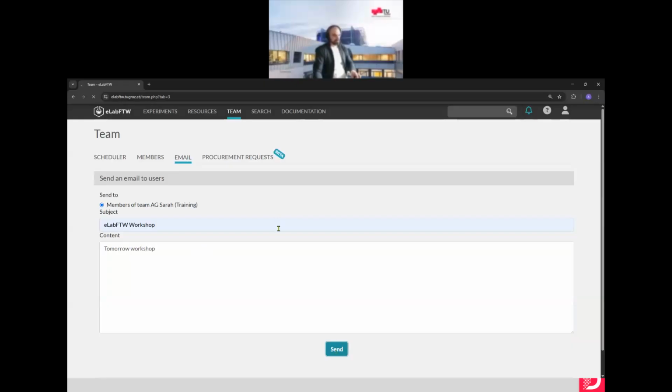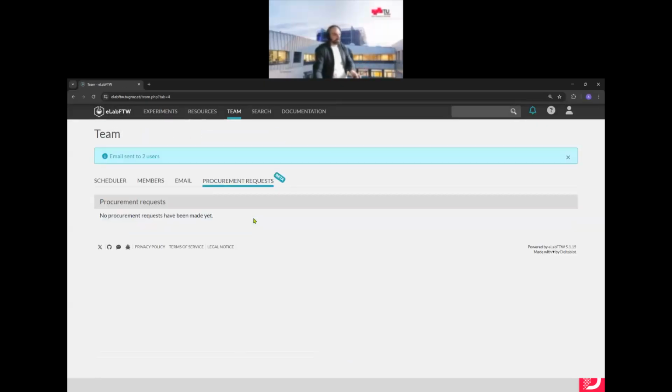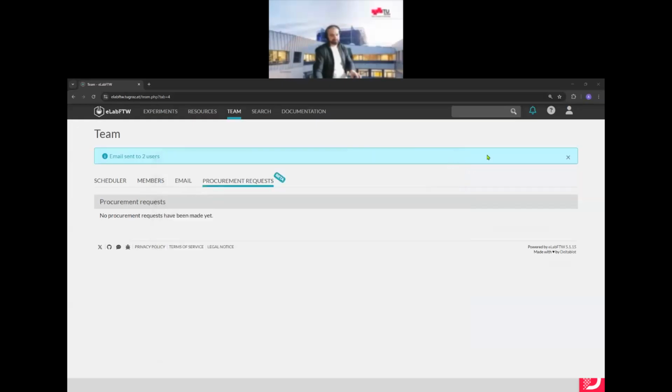And send this email to him, because maybe we have some onboarding workshop tomorrow. If I now check my inbox, okay, I already got the information, and you can see I got some information sent via the elab tool from Sarah. Tomorrow workshop, sent by Sarah Training.